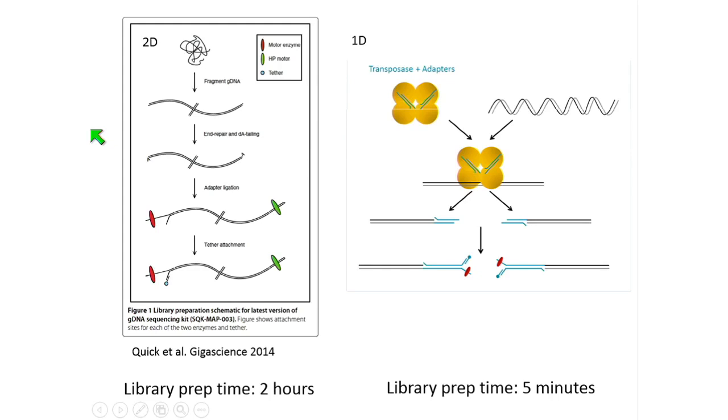There is a big difference between this platform and short read platforms in that you want to encourage the longest possible reads you can get, particularly if you're doing something like de novo sequencing, as Evan alluded to. So when we fragment DNA in order to get enough ends to do the molecular biology, we try and fragment gently. You tend to fragment to a mean length of about 8,000 bases and not longer. In fact, there's a huge amount of control you have over that process in the lab. You can use needle pipetting, you could use Pippin Prep to try and encourage much longer fragments.